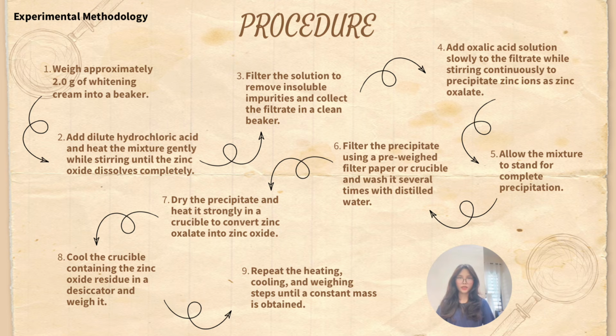The heating, cooling, and weighing process is repeated until a constant mass is obtained. This ensures accurate results for determining the amount of zinc oxide in the whitening cream. That's all for experimental methodology.